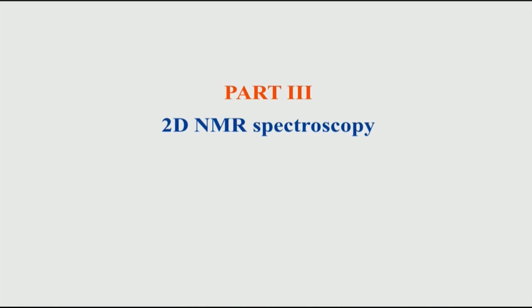From this class onwards, now we will move on to 2D NMR spectroscopy. Till the last part of the course we have looked at 1D NMR. So, now let us start with the important aspect of NMR spectroscopy, which is 2-dimensional NMR.